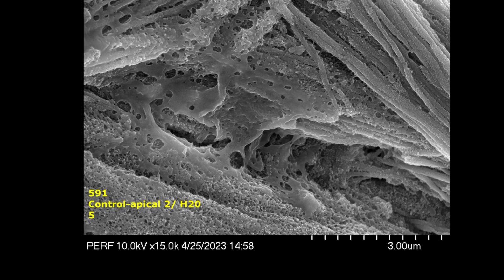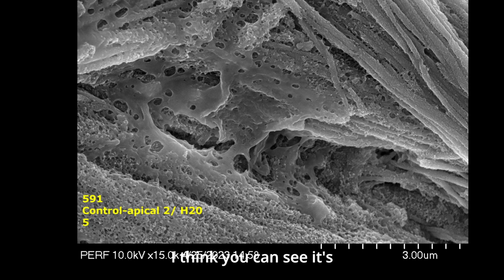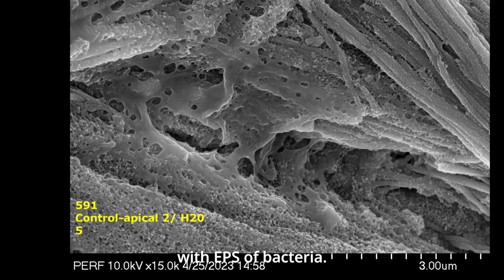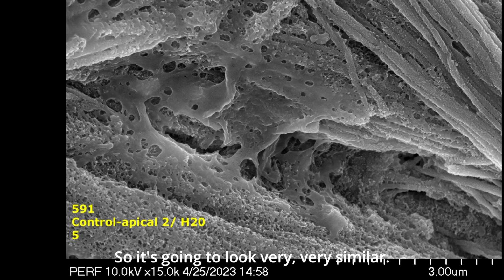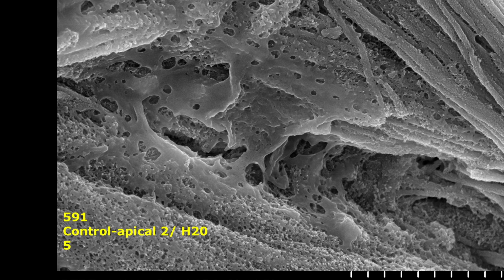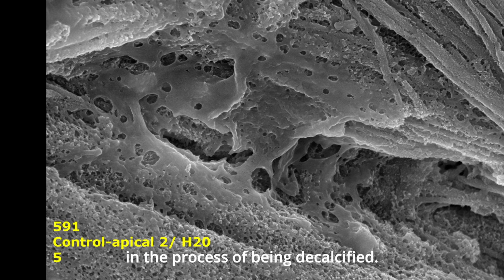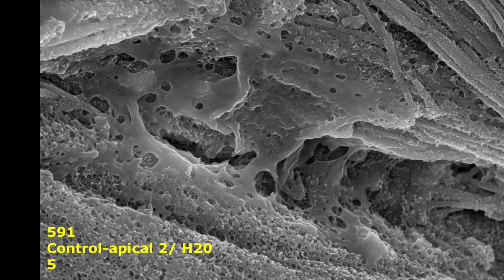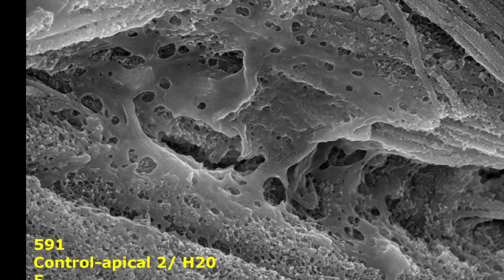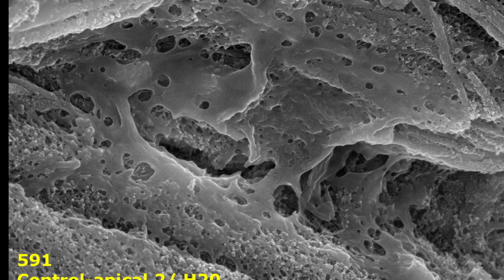But you gain a greater sense for what the mineralization actually looks like. I think you can see it's very easy to confuse this with EPS of bacteria. So it's going to look very, very similar. There's no way to really distinguish it. This is calcification occurring or collagen in the process of being decalcified. Again, this is right at the mineralization front of predentin. So you can see quite a bit of mineralization taking place.